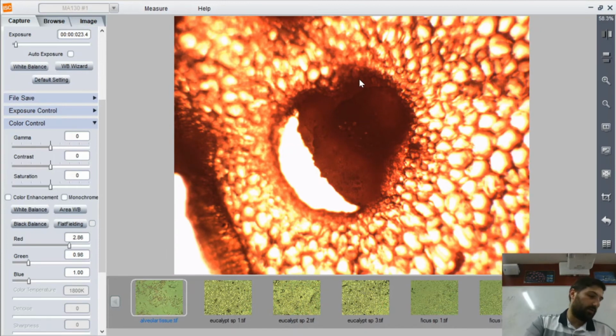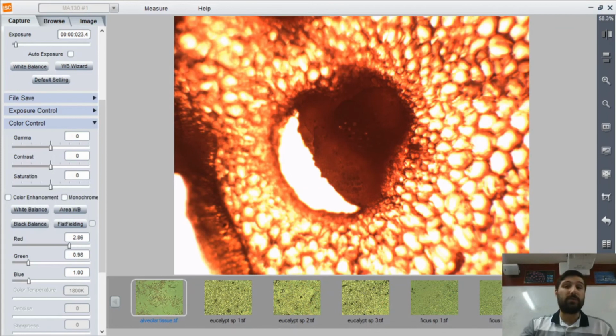What a good video. The questions are: explain the purpose of the eosin dye in this experiment. Describe how the dye is distributed in the plant. Has the whole stem turned the red color, or is the dye found only in particular places? Can you please explain your answer using evidence from the video? Describe the appearance of the xylem tubes. Suggest what causes the dye to travel to the leaves. And was the hypothesis supported? As in, did we actually see that it would just be that area colored red?